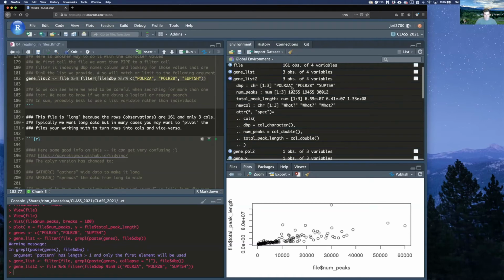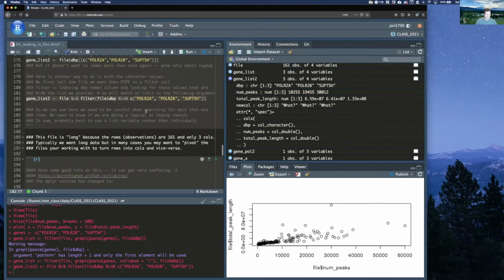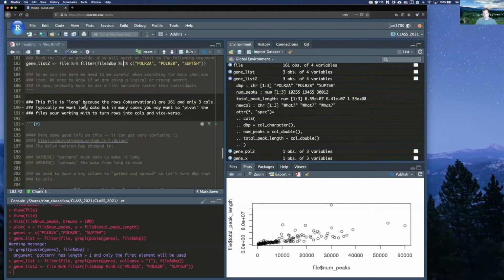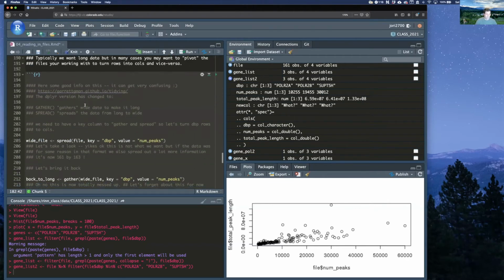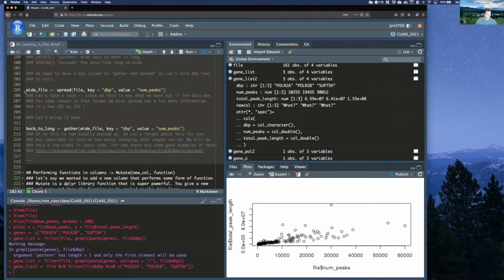And we have exactly what we had before. Okay, so now we know how to sort of select data from a file. Again, I know that we went over that fast. There's text to help you understand what's going on here, and take your time with this. And we're just going over this quickly to get the basic concepts.